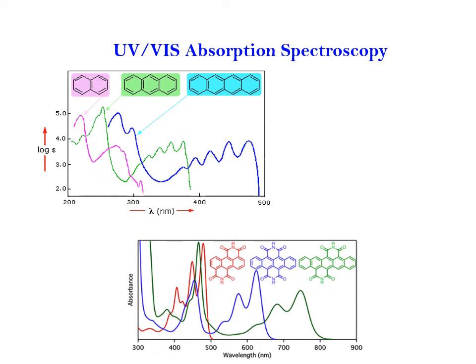As an example here, the spectrum of bicyclic diene shows some vibrational fine structure, but in general is similar in appearance to that of the isoprene molecule. So every molecule has its own specific absorption frequency. As you can see, for example, this molecule, which is indicated in pink, has its own unique absorption frequency.